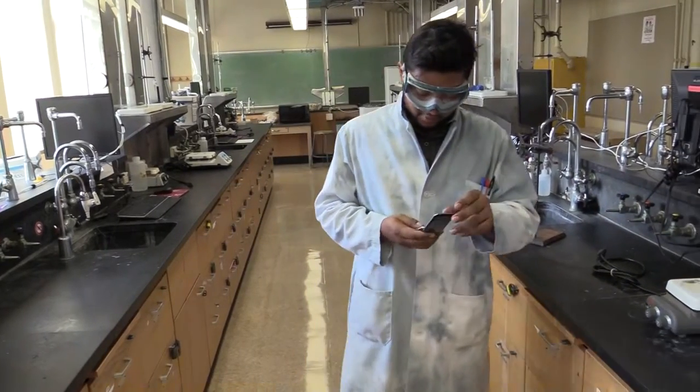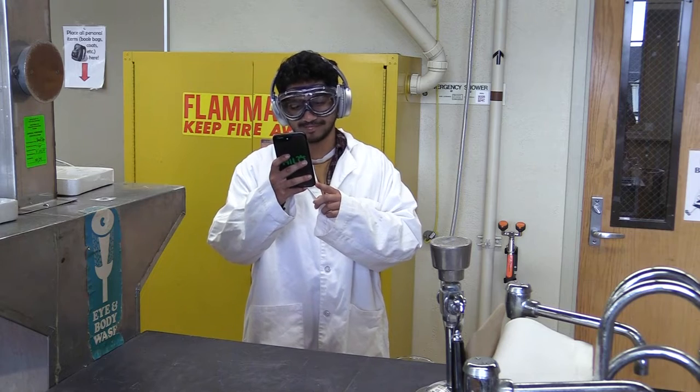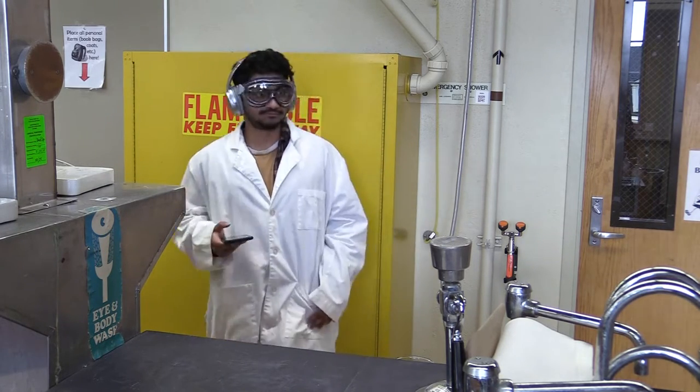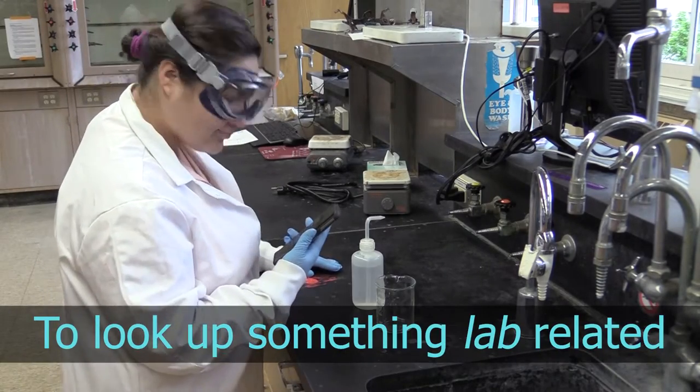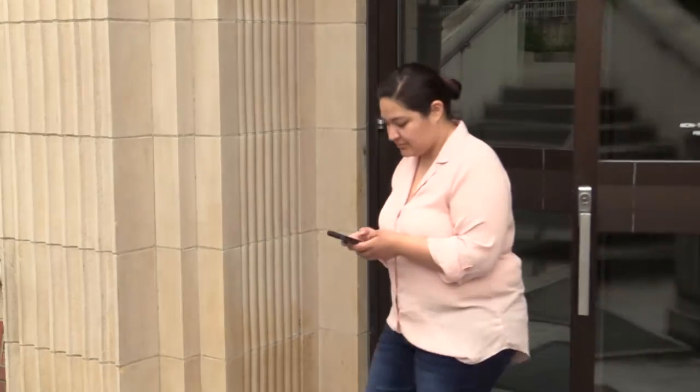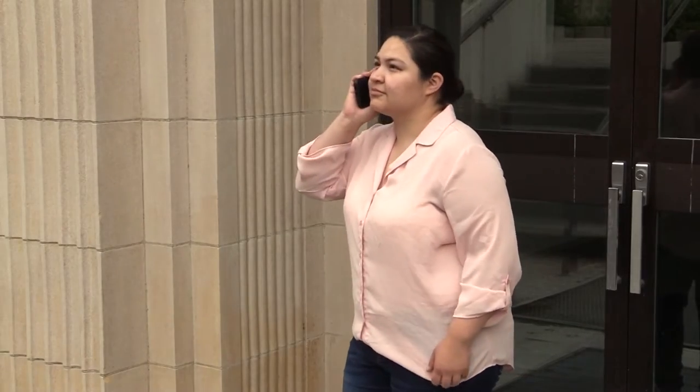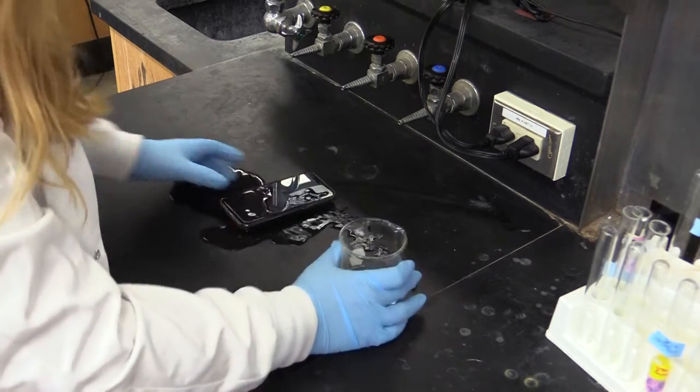You may notice there are no MP3 players allowed in lab. You also can't call or text people or use headphones or earbuds when you're in lab. They'll distract you in a place you don't want to be distracted in. If you do need to use your phone to look something up, don't hold it with a gloved hand. If you handle your phone with gloves that have chemicals on them, you'll end up transferring them from your phone to your face. And please don't leave your phone on the bench top where it could get spilled on.